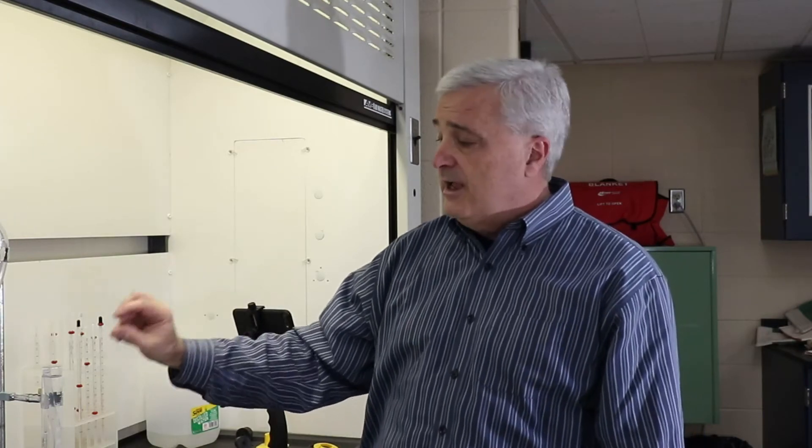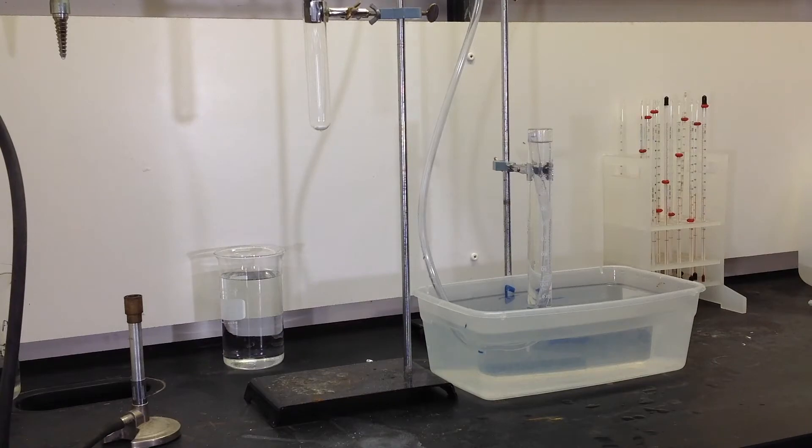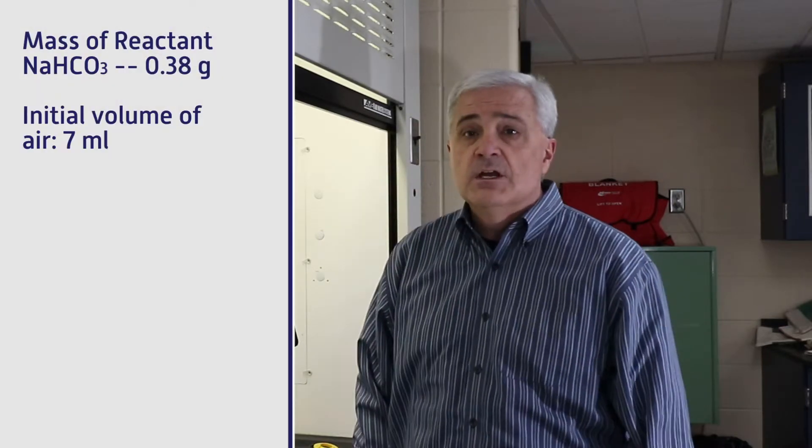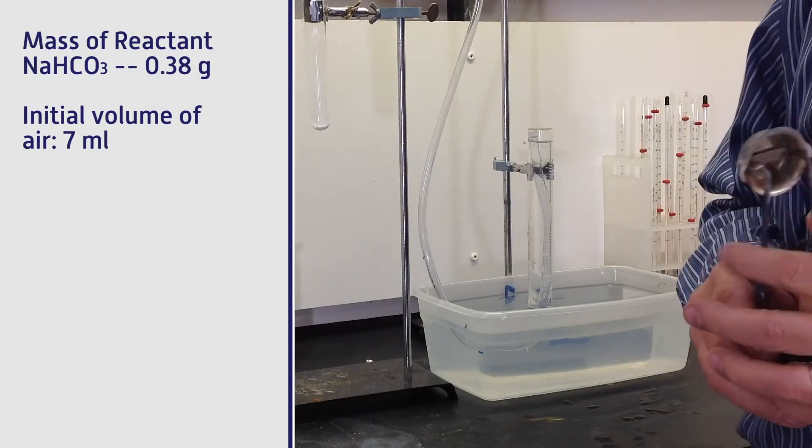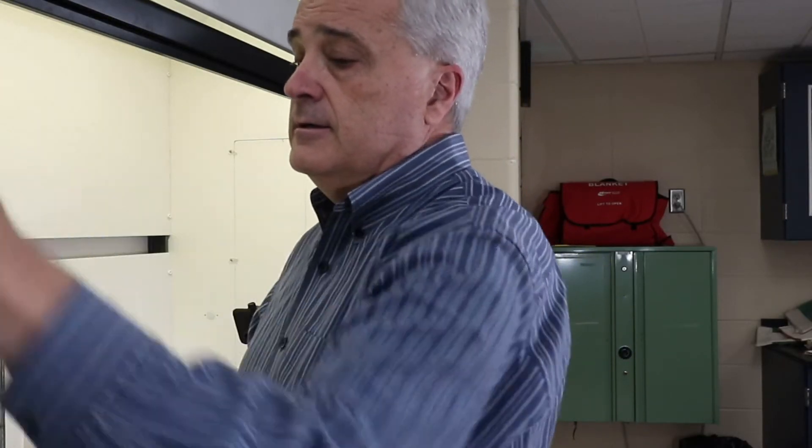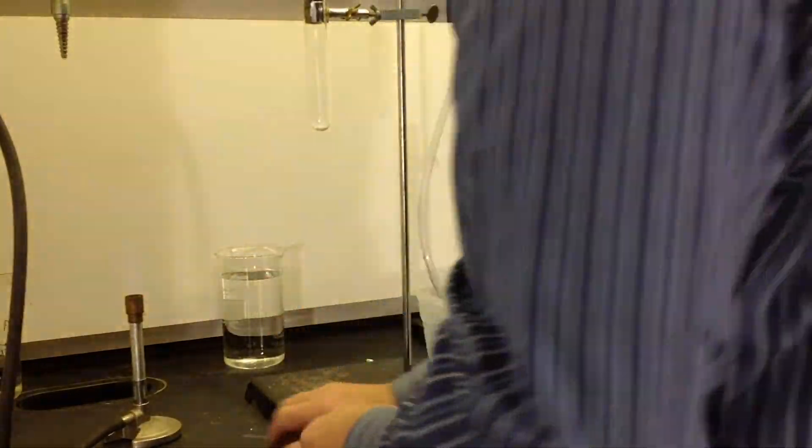At this point, I'm going to read the graduation and determine what the initial volume of air inside the graduated cylinder is. And so I'm reading that to be seven milliliters. Now I need to light the burner. I'm going to turn the vent on, turn the gas on, and light the burner. Now we're ready for the reaction to begin.